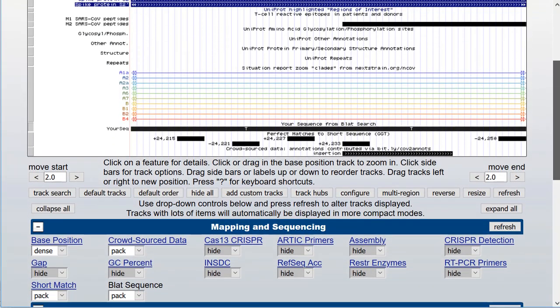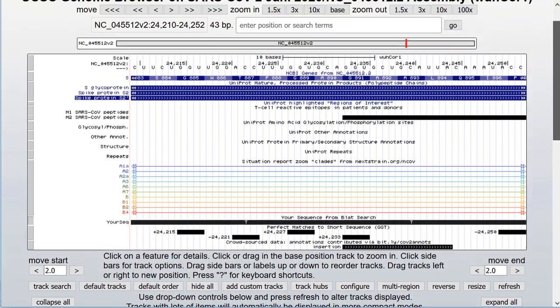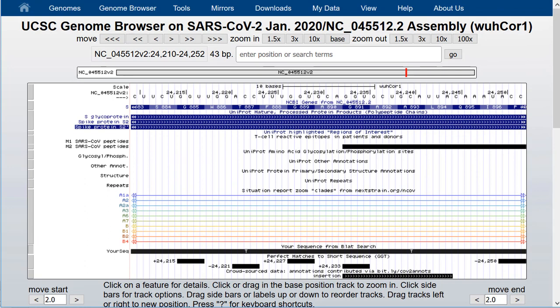So this has been a whirlwind view of some of the features of the Genome Browser and how to get around in the browser. It is worth mentioning that the display features demonstrated here are universally available in the Genome Browser for any of more than 100 animals without regard to which genome assembly you are using. The data, of course, will be different in each assembly.